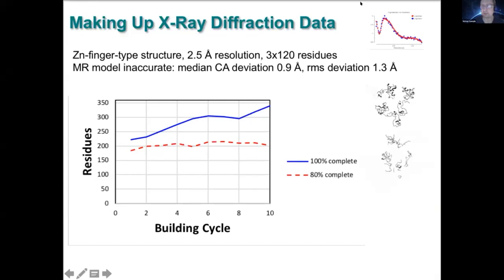If you look at this diffraction intensity falloff, then it goes down, and I think it was the group of Carmelo Giacovazzo which some years ago said that when we truncate the data at a certain resolution, we basically assign all the structure factor amplitudes the value of 0, while we expect that it would somehow go smoothly down. And the question was why 0 is better than any other number.